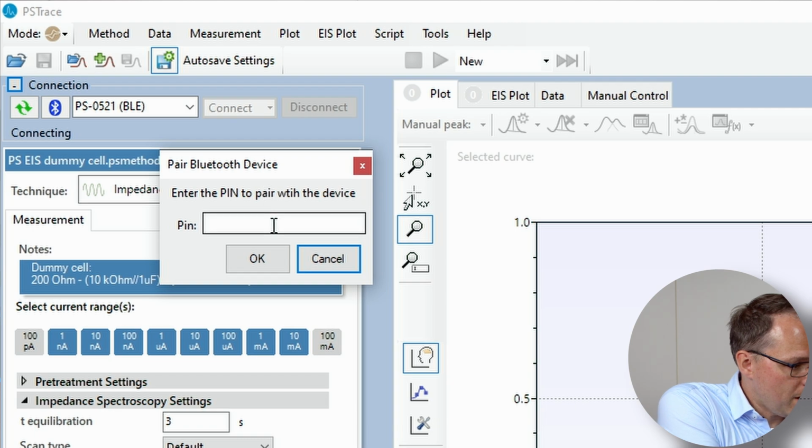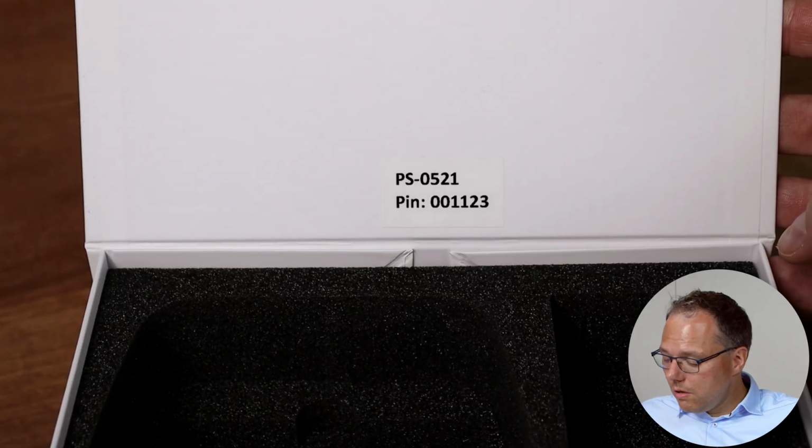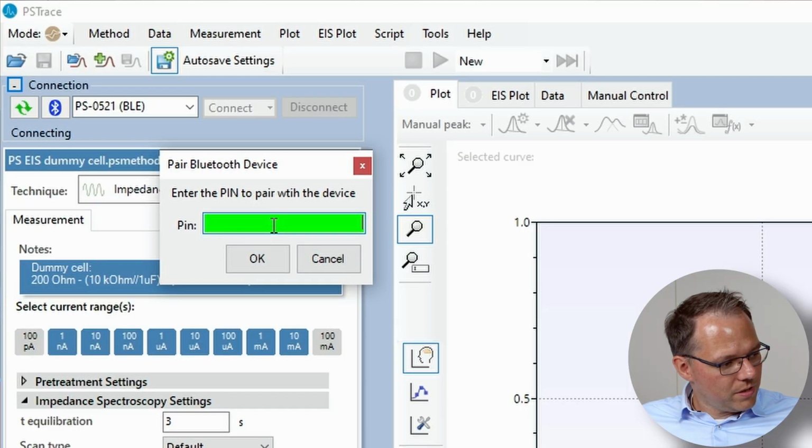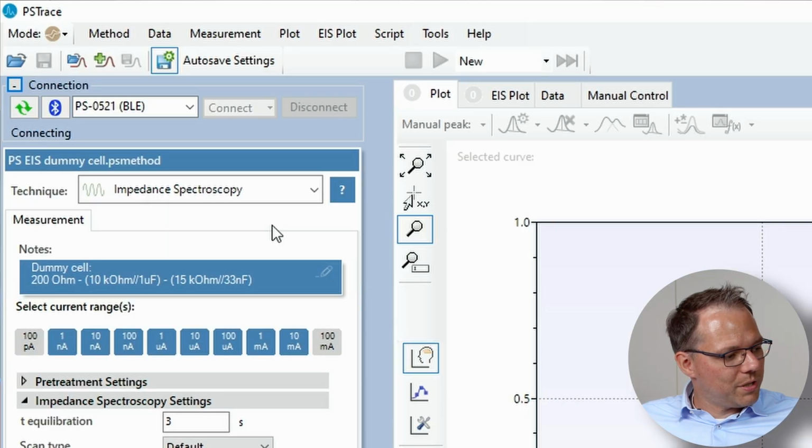Since this is the first time I'm connecting to this device, I will be asked for a PIN code. You find that PIN code also in the box. So I have here my PIN code. And then I press enter to connect. For my first measurement, I want to make it as easy as possible for me and very convenient. So I will load a measurement that has already been pre-installed when I installed PSTrace.